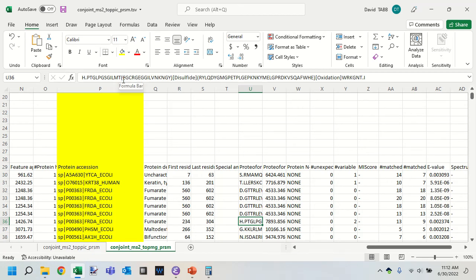The disulfide could occur on a glutamic acid, on a glycine, on a cysteine, on an arginine, on a glycine. That's rather weird if you ask me. The software is asking essentially, does it have fragment evidence to prove that it's on this cysteine rather than on these other amino acids? But we disallowed disulfide from being on anything other than cysteine.